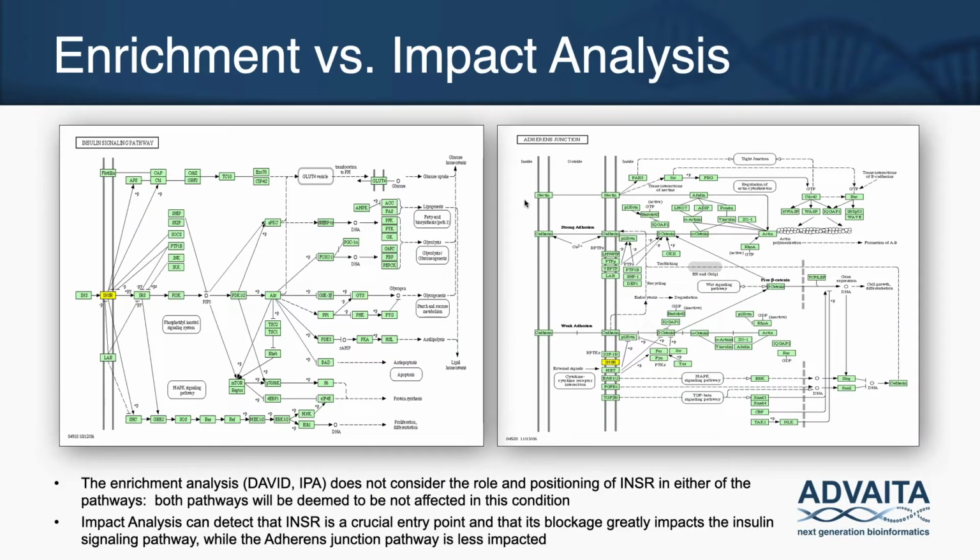Okay, so I want to just give you a side-by-side comparison of enrichment, which is the standard way that people generally do pathway analysis, versus impact analysis, which is what's implemented in iPathwayGuide, just so you have an appreciation for how we approach pathway analysis. So from an enrichment point of view, let's look at these two pathways.